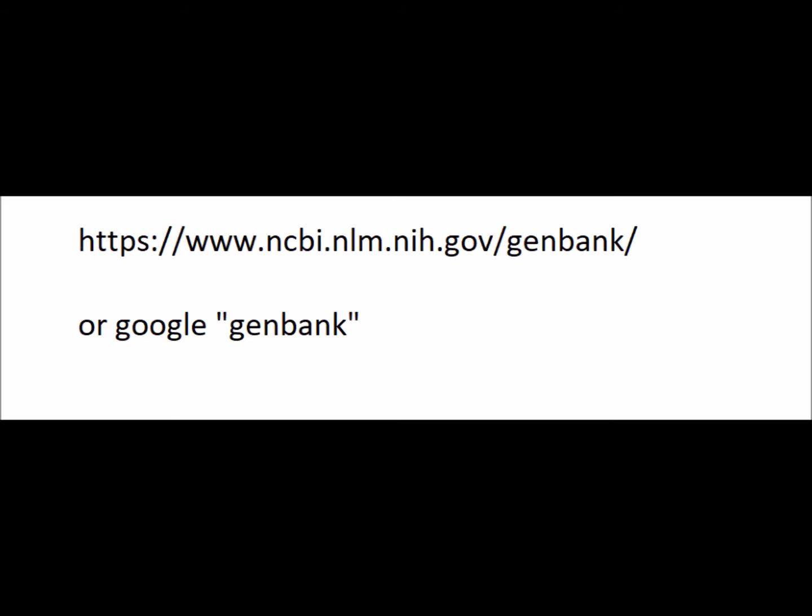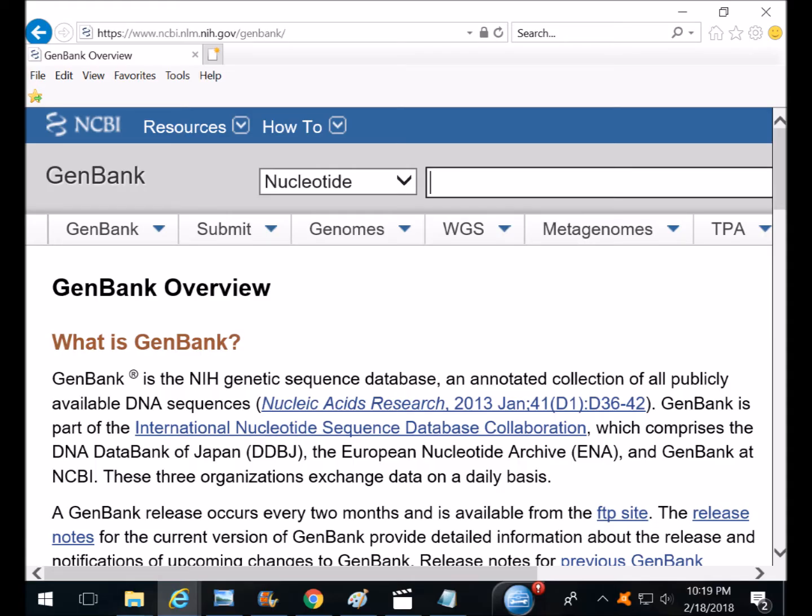Anyway, once you visit that website, you'll get a homepage that looks like this. In the interest of time, I'm going to skip a lot of explanations as to why I'm doing certain things. Suffice to say, I found out how to do some of this the very hard and difficult way, but I'm just summarizing how to do this. So once you're here at the GenBank website, go to that search box that I just circled in red and type in the following character string.